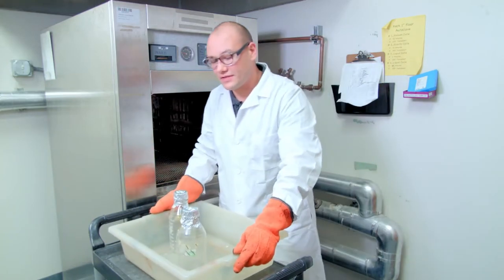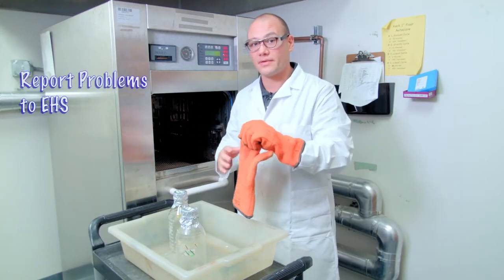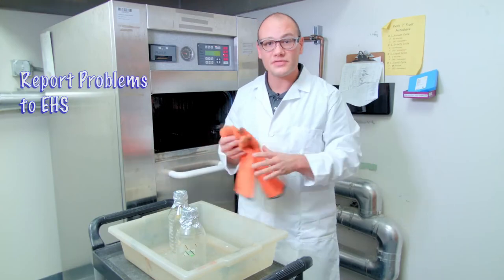Environmental Health and Safety tests autoclaves on a monthly basis. If you have any problems please report them to us.